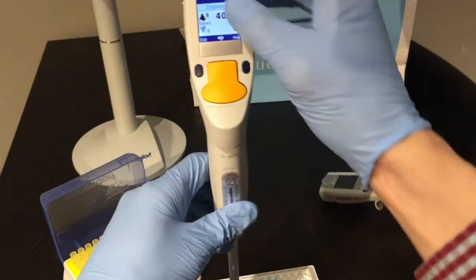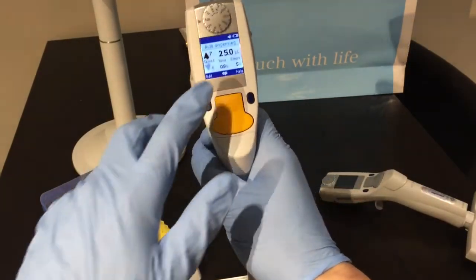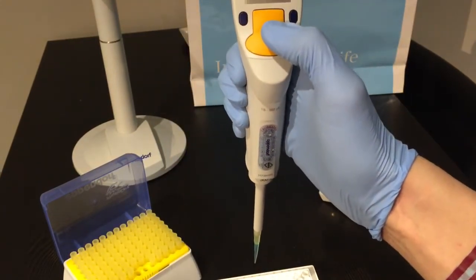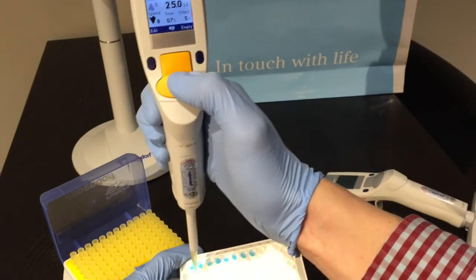Next is auto dispense mode, which is basically the same as dispense mode except it adds a time interval. After dispensing the first volume, as long as I hold the down button it dispenses at 0.7-second intervals automatically, which makes life just a little bit faster.